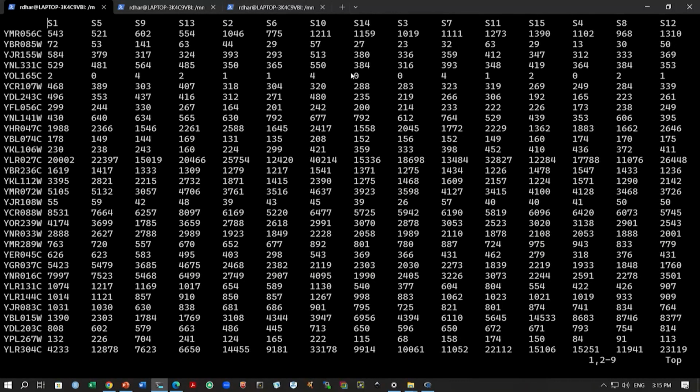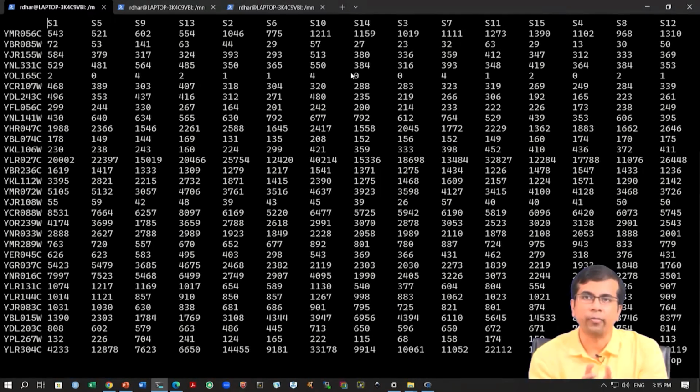Okay. Now these samples are organized in certain ways, which will come about later on when you actually go to the differential expression analysis. That is when the whole thing will be more relevant. So how these samples are organized, which are the replicates, etc., that information we will talk about later on. Okay, so as you can see, this is a matrix. So we would like to load this in R, and then we will start working with that.